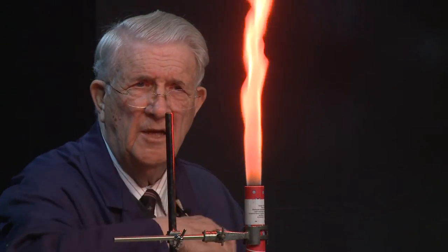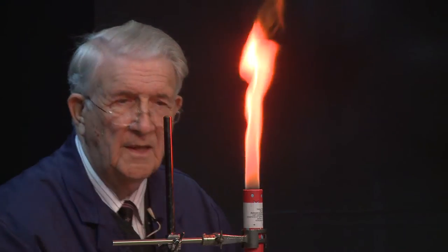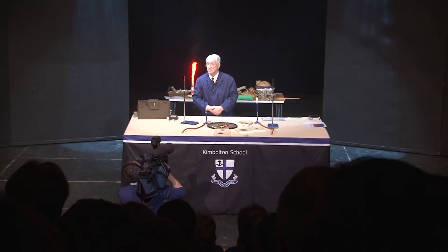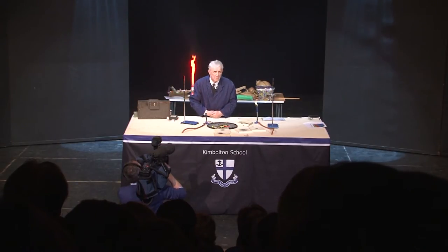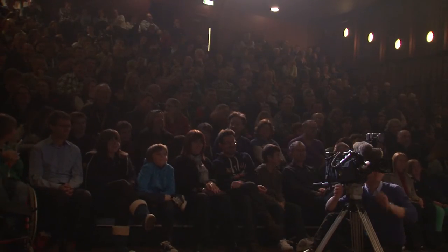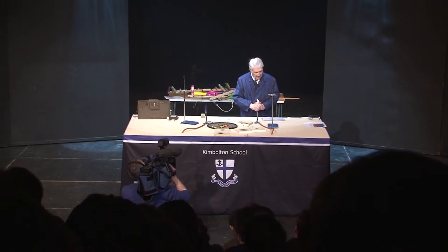Nitrocellulose is a very cool burning — I'm not going to hold my hand in it, but you can see it's not particularly hot. And it doesn't produce any noticeable smoke, though in fact it's probably producing nitrogen dioxide, so not a word to health and safety. You can see that it burns a long time, and it's really quite effective. So those are nitrocellulose colours.